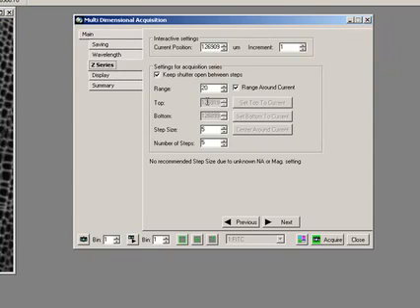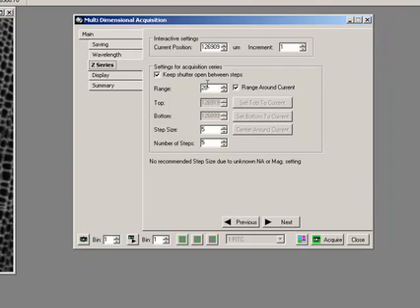This tells me my current position and how many microns I'm going to move when I press the up and down buttons here. And I can operate this in a couple of different ways. I can do range around current. So currently this is setting my position where I am by default and saying I want to travel 20 microns. That's 10 microns up and 10 microns down, or actually this is 20 microns up and 20 microns down.